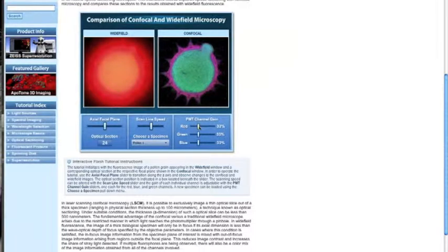Changing the red, green, and blue channels shows the certain color being increased more strongly, and more of that color is amplified and appears more vivid or brighter. Fluorescence emission gathered from the specimen is filtered through a confocal pinhole aperture to reject light that originates from regions removed from the focal plane.